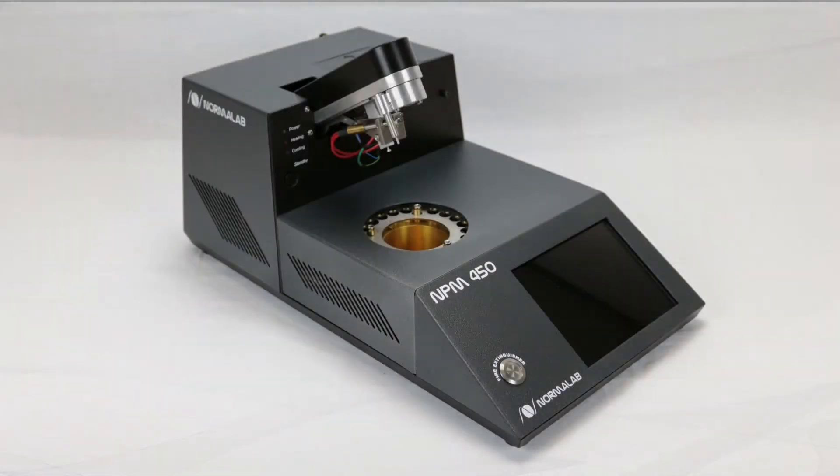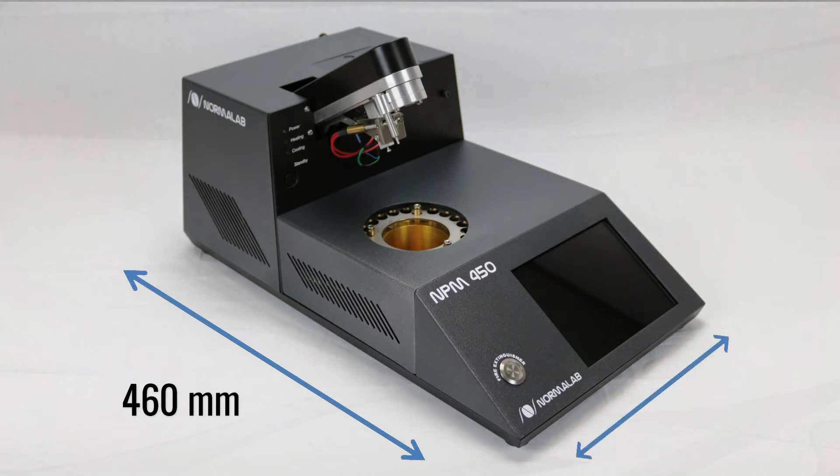Unit dimensions are 460 mm long, 260 mm wide, and 185 mm high.